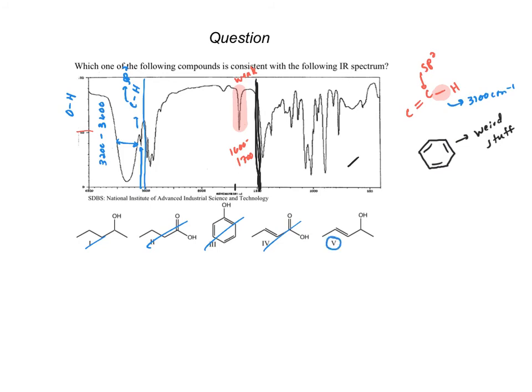Now, there's one little thing I want to note, which is kind of cool here. We found that weak signal for the carbon-carbon double bond at about 1700. But note that there's a tiny little bit of a peak here, a little bit to the left of that carbon-carbon double bond. Who do you think that's due to? It's not strong, but who could that potentially be from? Because this is coming in at about 17 to 1800, just to the left of a carbon-carbon double bond. Who do you think that could be from?